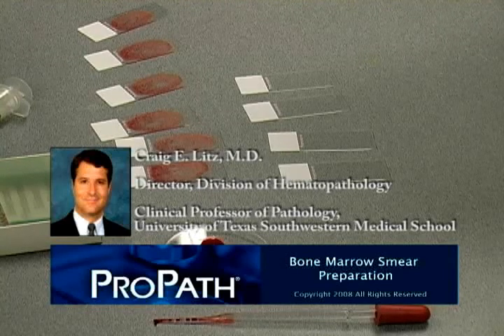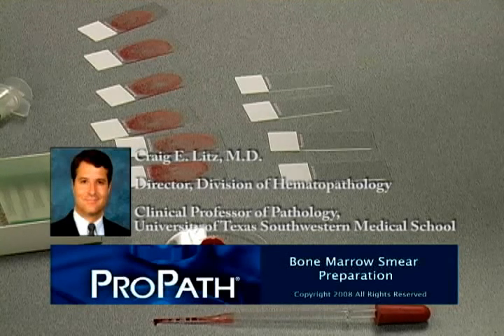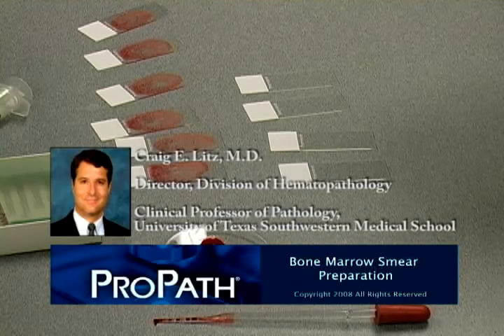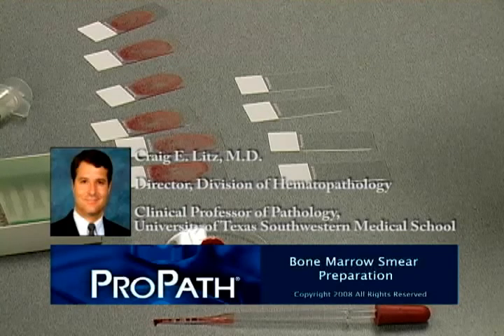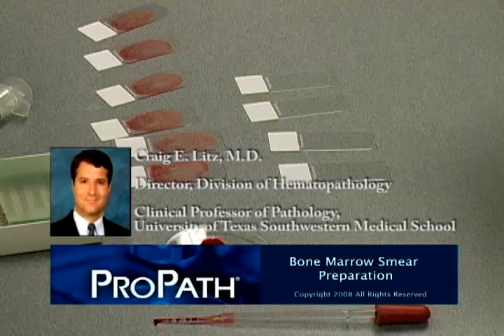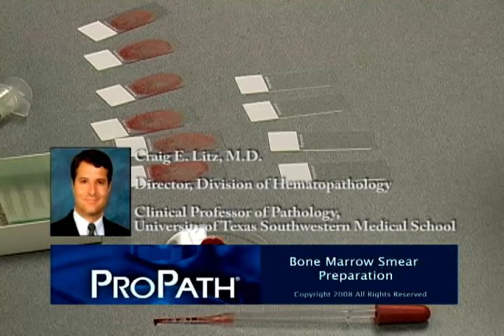The proper preparation of bone marrow smears for microscopic exam is the single most important aspect of the bone marrow biopsy procedure. Subtle abnormalities will not be detected on poorly prepared material, delaying patient diagnosis or worse, causing a misdiagnosis. This film summarizes proper marrow smear preparation.